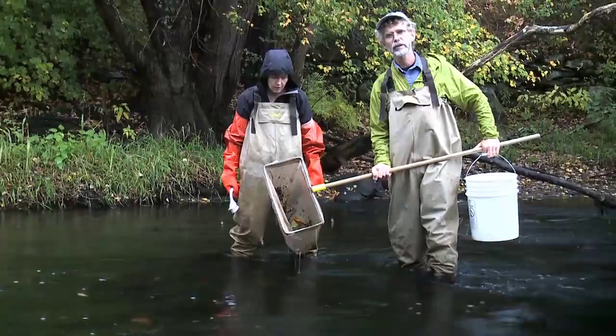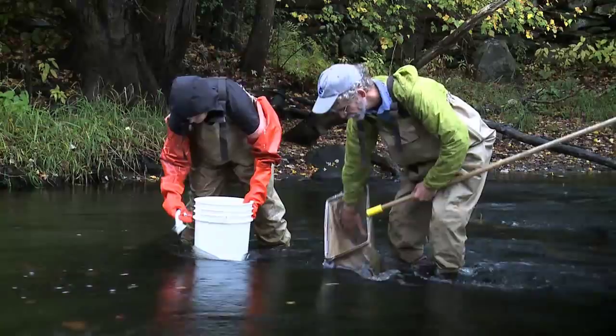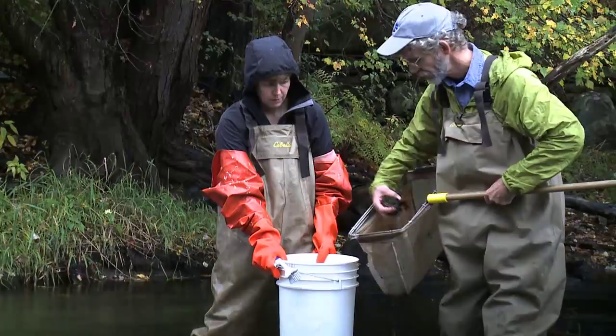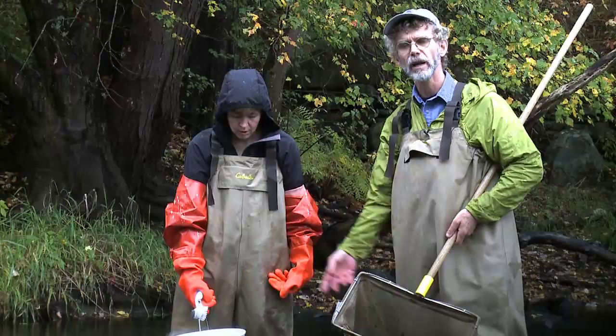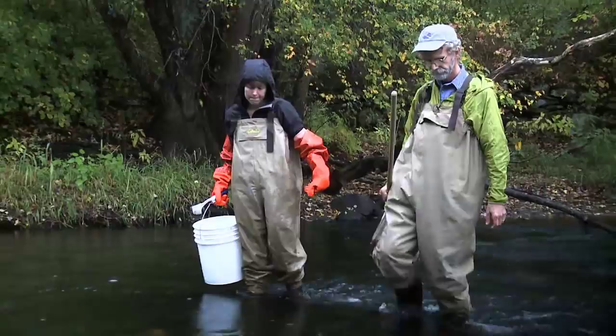What we want to do is wash that sample to get any fine sand out of it and put it into the sampling bucket. So I'll wash the sample and take this accumulated material that we're going to put into the sampling bucket. We'll come to the shore to do that.